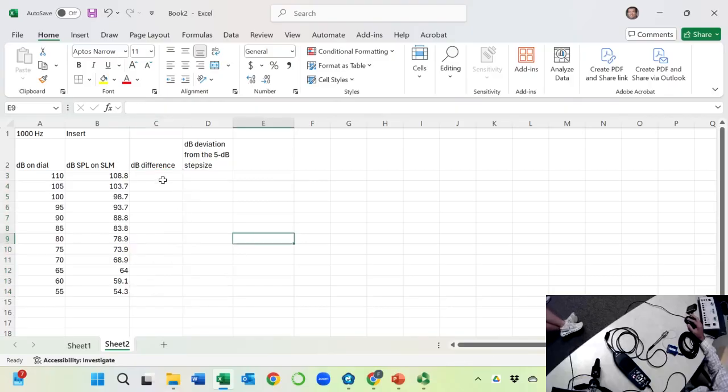The deviation should be the first one minus the one under it. Am I making sense?